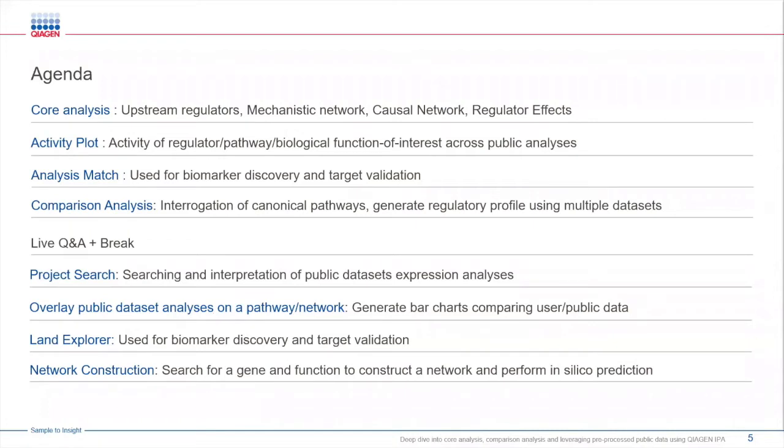Next we will look at the land explorer feature. This will provide you insights about your gene or a target and tell you how it's expressed across different diseases, different treatments, tissue types, etc.